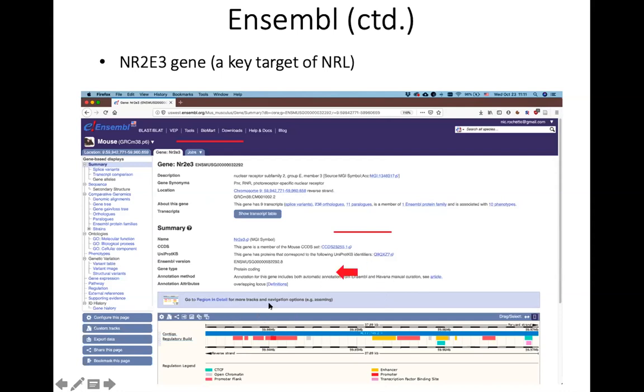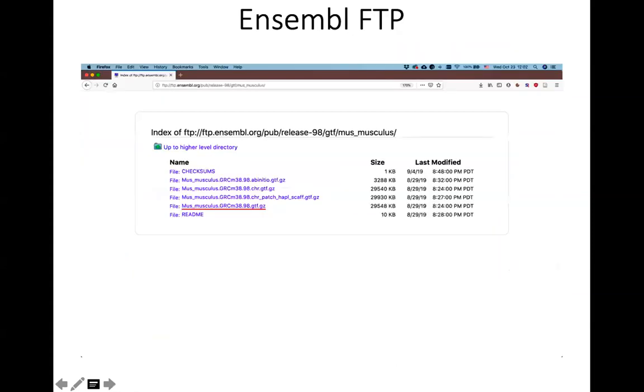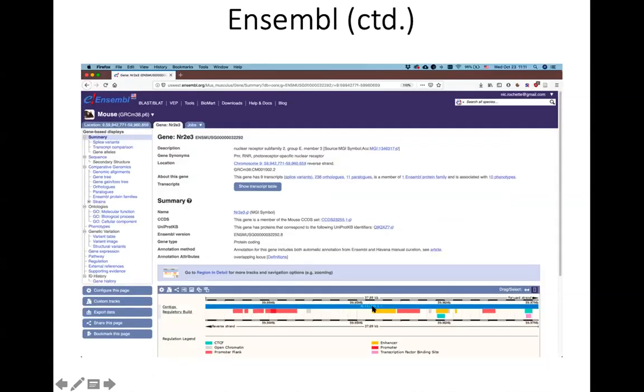And then if you click on go to region in detail here, you arrive at, what is this? Oh, I didn't include the screenshot in here. Anyway, you have this small plot of the region when you look at the gene itself. But then, as in a regular browser, you can go to the actual region on the chromosome, and add different properties you are interested in, like seeing exons, annotation, documented methylation for human or mice, the surrounding genes, any kind of information you might be interested in.